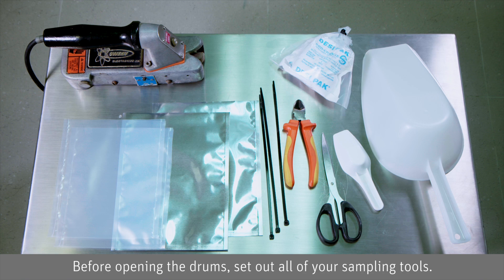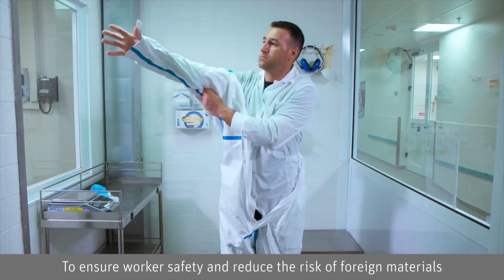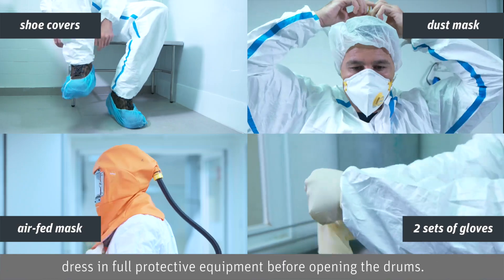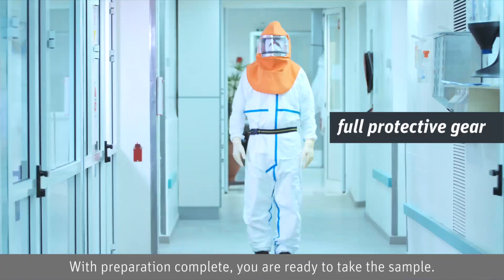Before opening the drums, set out all of your sampling tools. To ensure worker safety and reduce the risk of foreign materials contaminating the sample or bulk product, the technician needs to dress in full protective equipment before opening the drums. With preparation complete, you are ready to take the sample.